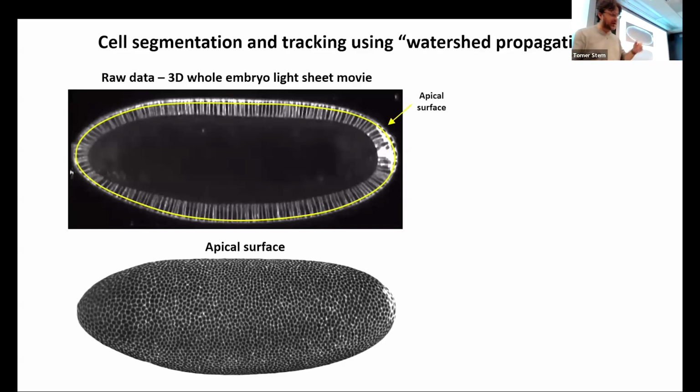Well, first of all, we're focusing here in this segmentation only on the 2-dimensional surface that is located about 5 microns under the apical surface. The reason for that, well, technologically, of course, it was easier. And also, 5 microns is where most of the mechanical machinery of these cells is located. So this is where it's interesting to look at.